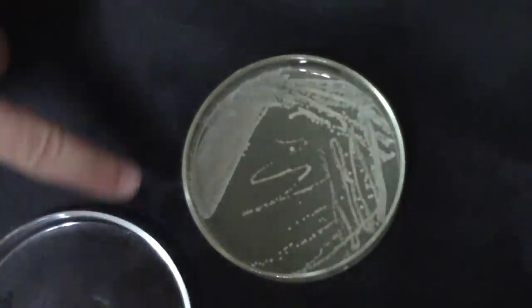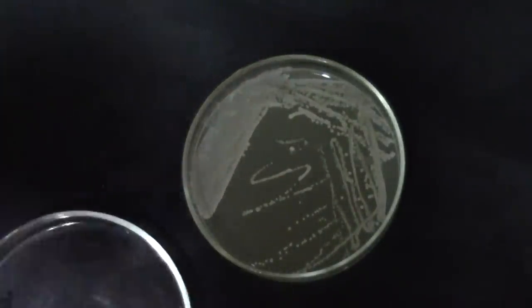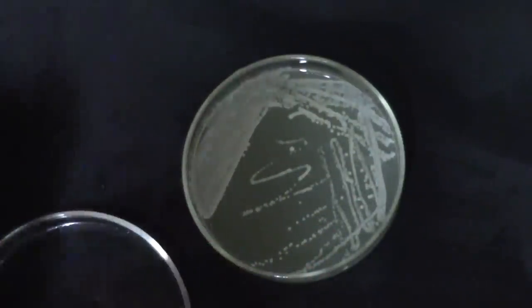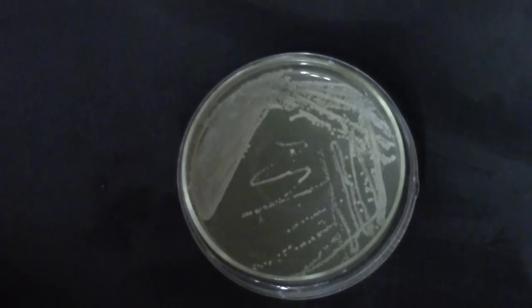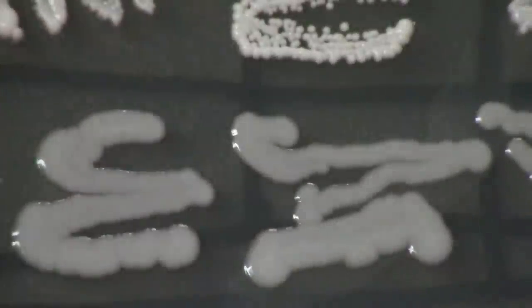This plate here shows some colonies recovered from a commercial bottle of lambic. In this particular lambic I know for a fact that there is Pediococcus and Lactobacilli, which are both bacteria, as well as Saccharomyces and Brettanomyces yeast, and yet as you can see, all the colonies on this plate look the same. This is an excellent example of why we cannot simply tell what species are what based on the way they look, because among the ones we want, they all look the same.